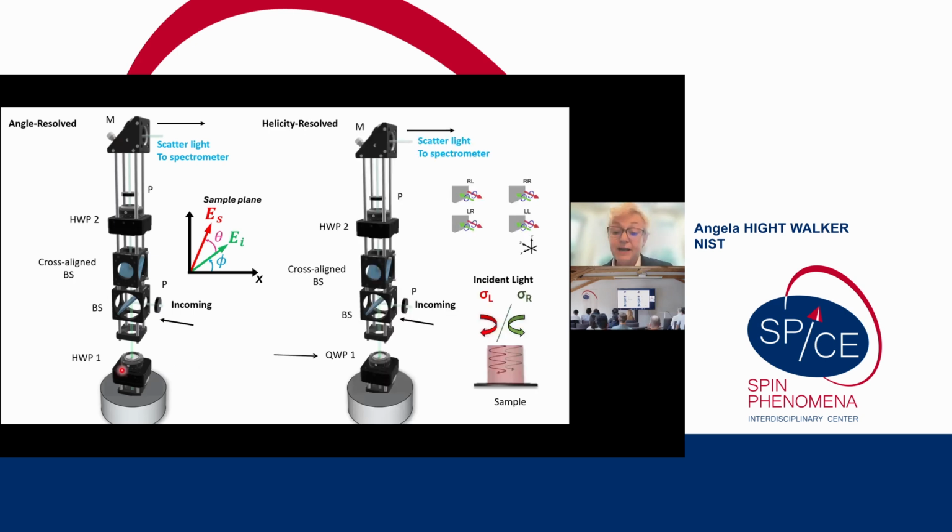If we change out the half-wave plate on the entrance, we can, of course, do helicity-resolved Raman, and of course that has led us a bit into this community of looking at phonons or magnons or excitations that have a handedness to them.